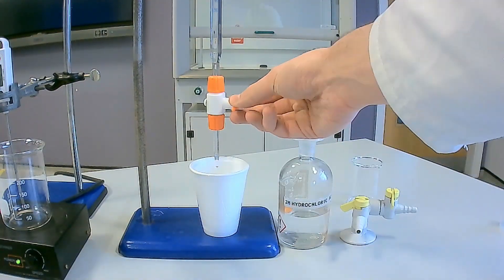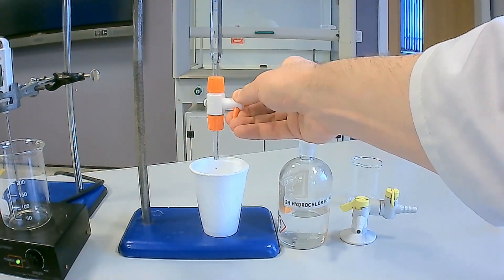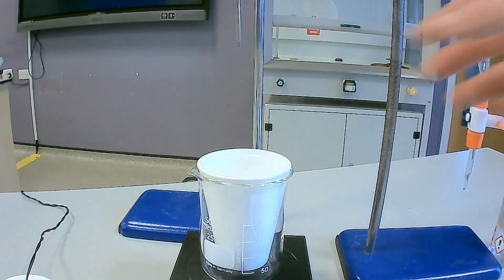Then fill a cleaned burette with 2 molar hydrochloric acid. Transfer 30 centimetres cubed of the hydrochloric acid into a clean polystyrene cup. Place the polystyrene cup containing the hydrochloric acid into a 250 centimetre cubed beaker for improved stability.